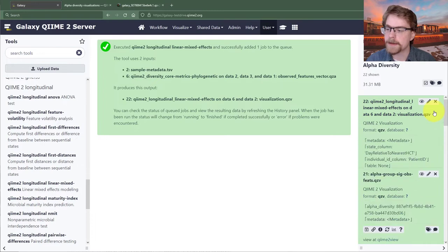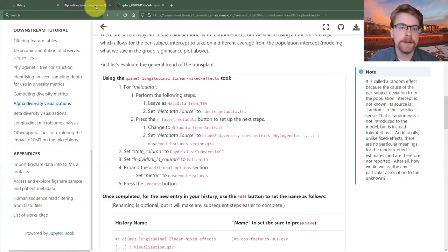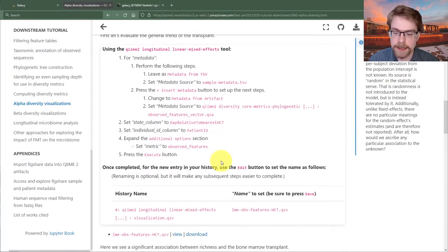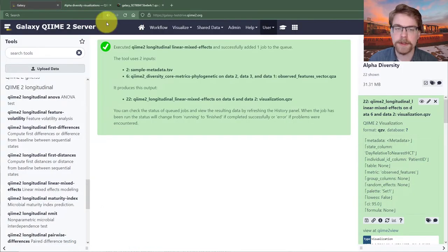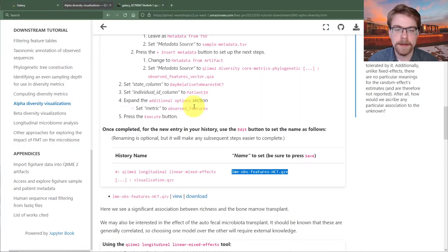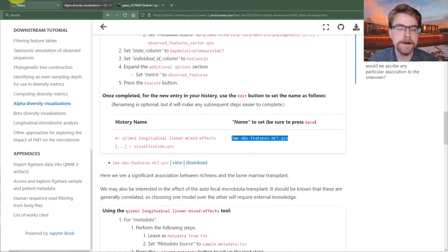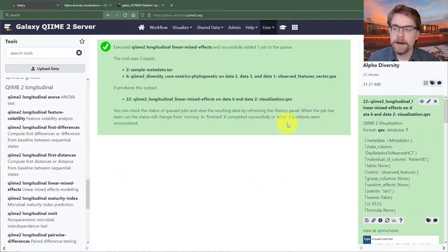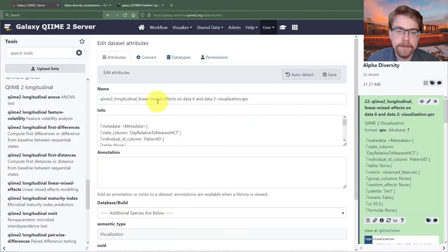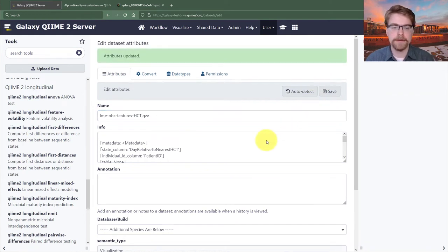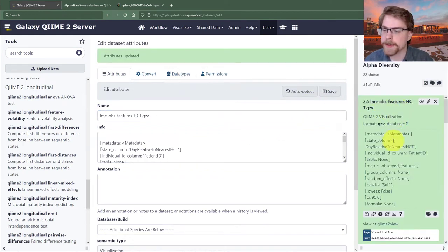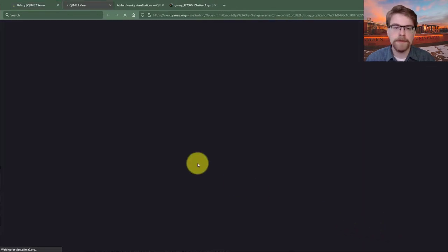The tutorial indicates I should rename this to 'LME observed features HCT'. I'll click the edit button, rename it, and save. Now let's have a look — I'll click view at QIIME 2 view.